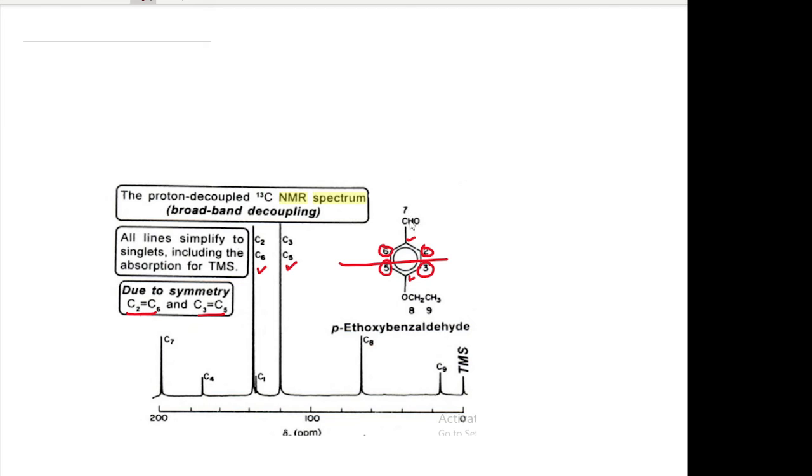So CHO, C double bond O, single bond H, okay. So this is an aldehyde. You can go back to the spectrum and just look at what will be the signal of this type of carbon. So this signal is about 200. So if you don't know the molecule, you can look at the spectrum and assume that at 200 there is an aldehyde carbon, so you can write in your structure that there is an aldehyde carbon.